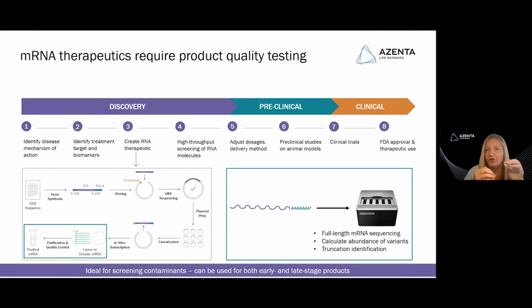So do I have 30, 30, 40 or 33, 33, 33? And again, what version you want is going to be up to you, but you'll be able to determine that with your next generation sequencing. And then lastly, we're going to still make sure that it's all the way intact. So we want to make sure there were no truncation events. Is my poly A tail length correct? Does it have a tail? Did I get products without a tail?